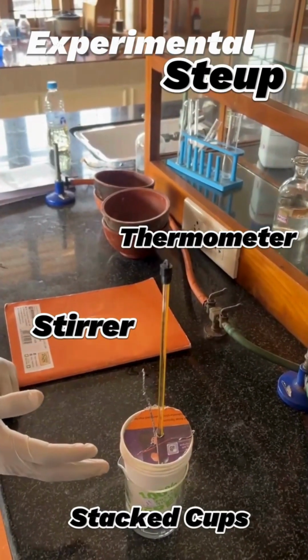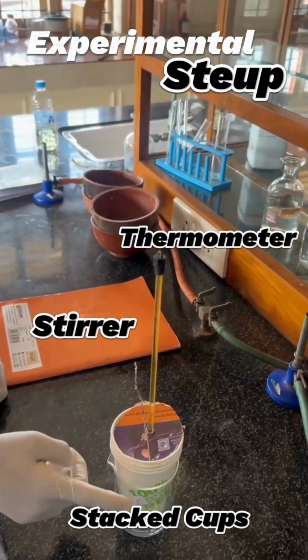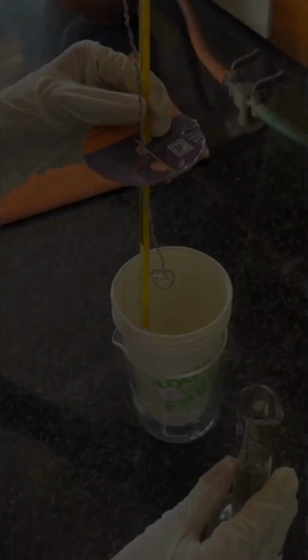The experimental setup includes a coffee cup calorimeter placed inside a beaker for added support. A thermometer is inserted through a cardboard lid, which helps to minimize heat loss to the surroundings. A stirrer is used to ensure uniform mixing throughout the experiment, improving accuracy and temperature readings.